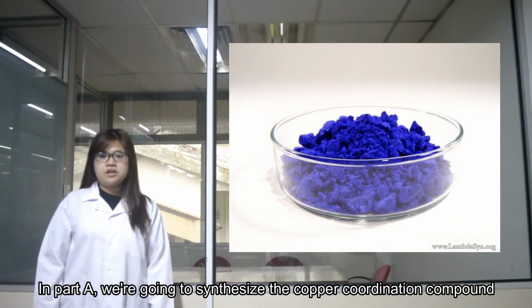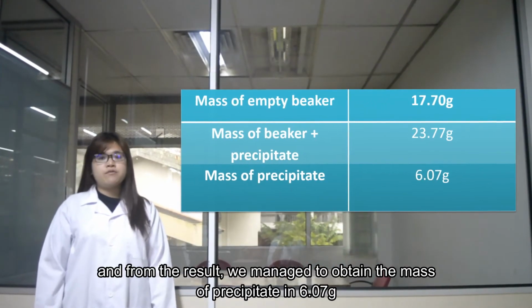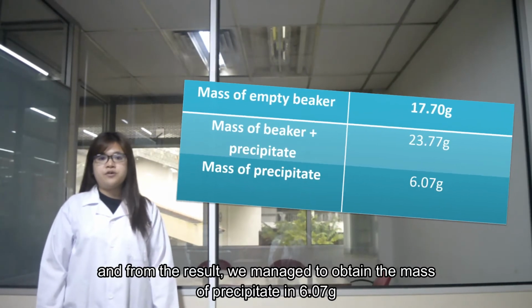In part A, we are going to synthesize the copper coordination compound, and from the result, we managed to obtain the mass of precipitate of 6.07 grams.